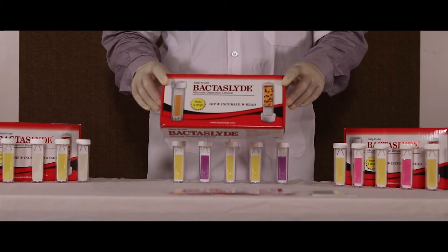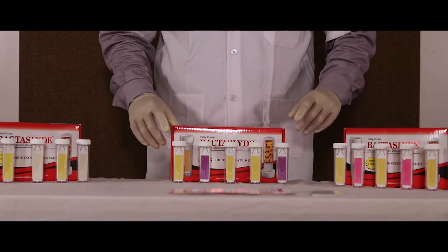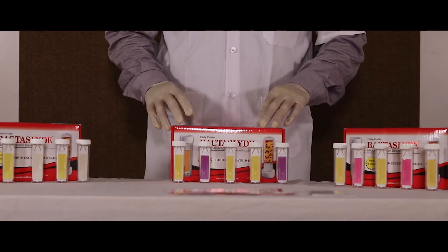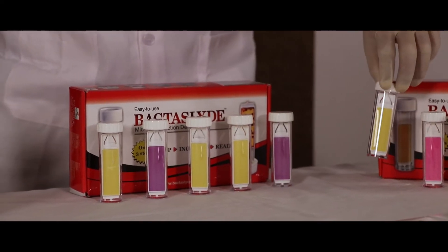This is the Bacta Slide bacteria testing kit. These are three ranges of Bacta Slide: BS101, BS102, and BS103. Each slide has two sides.